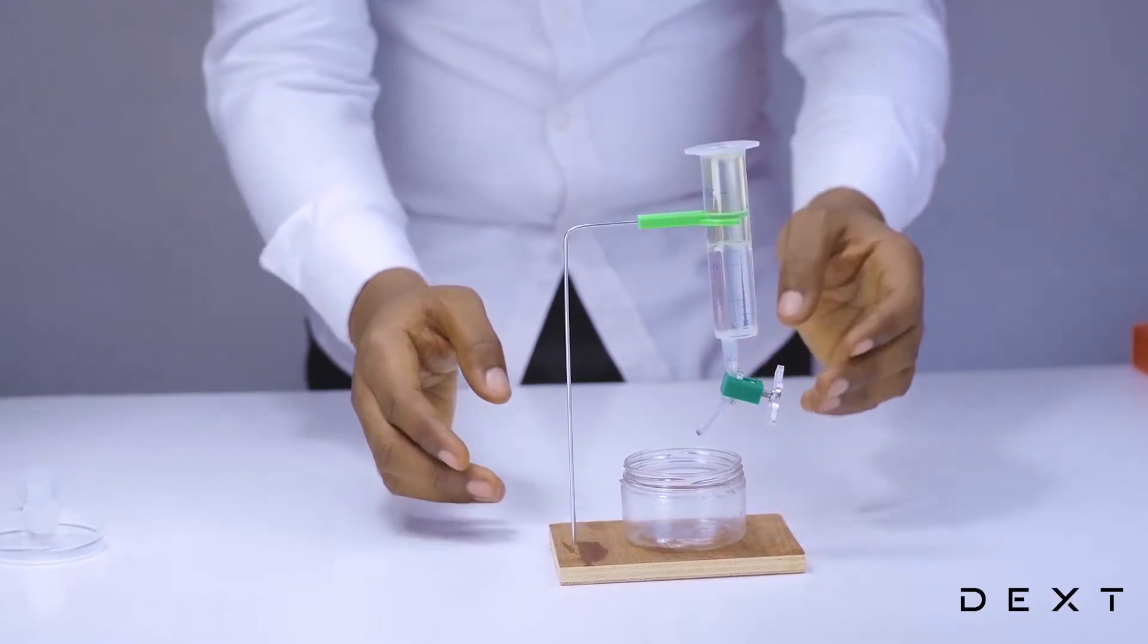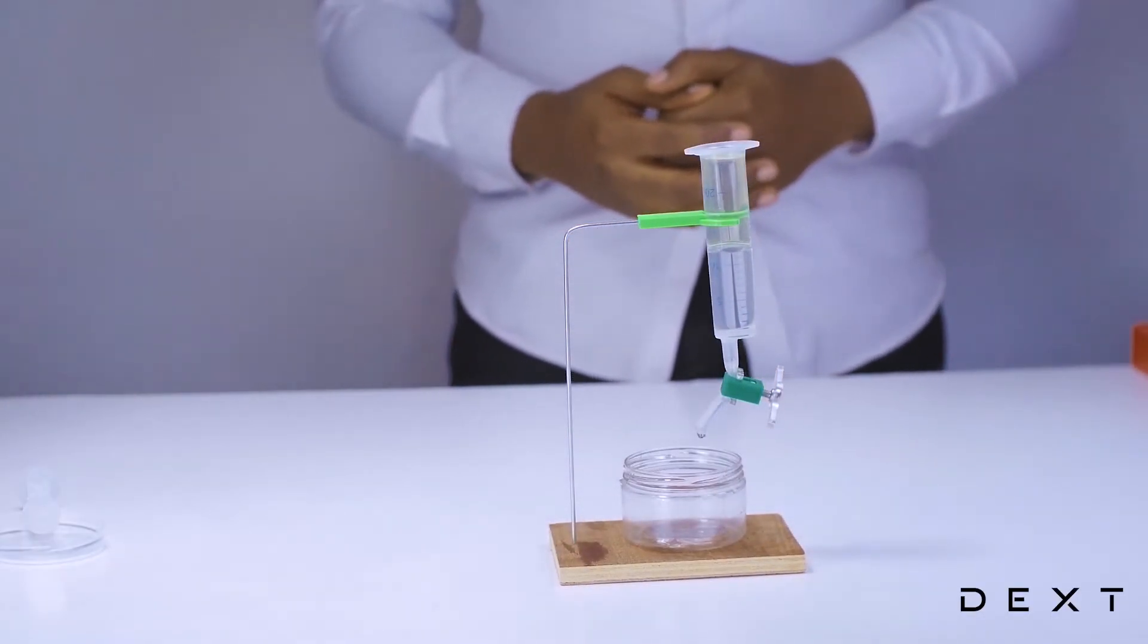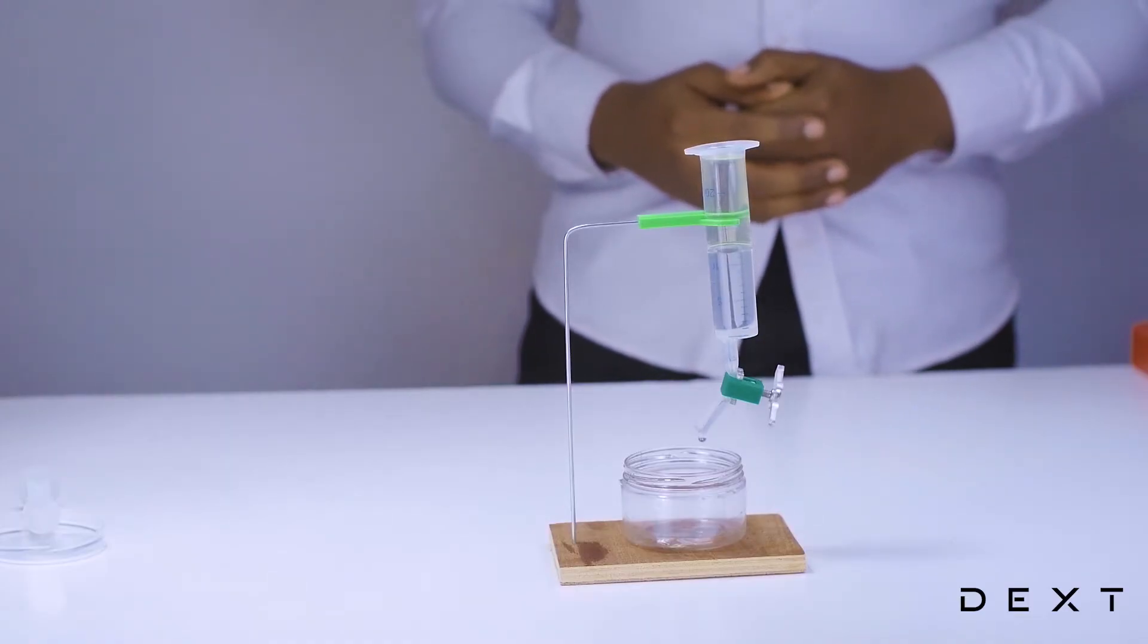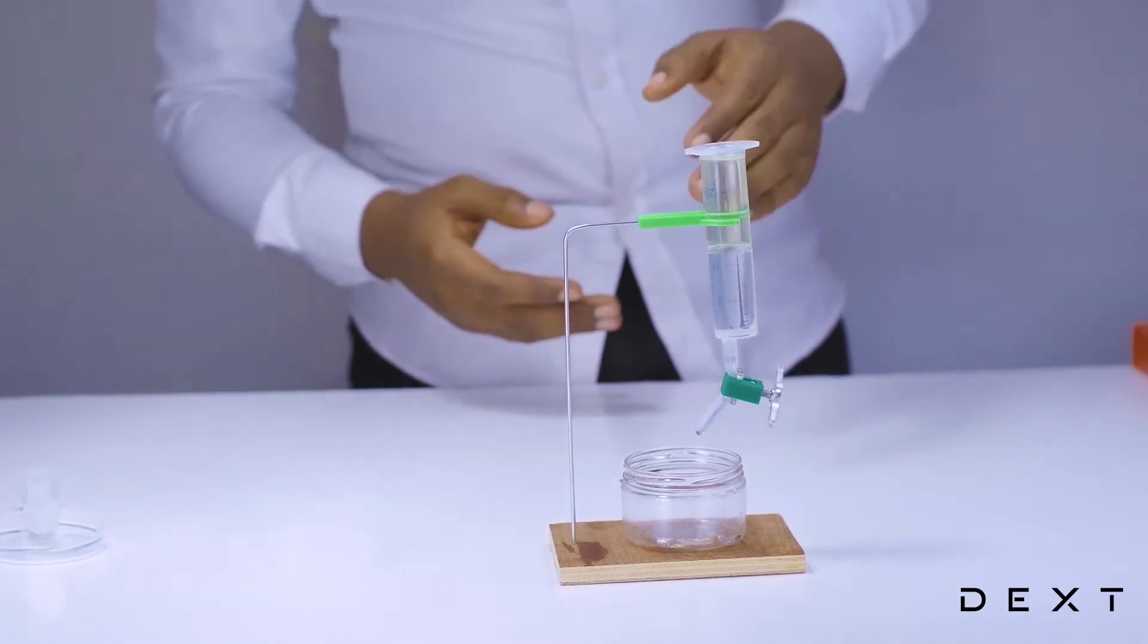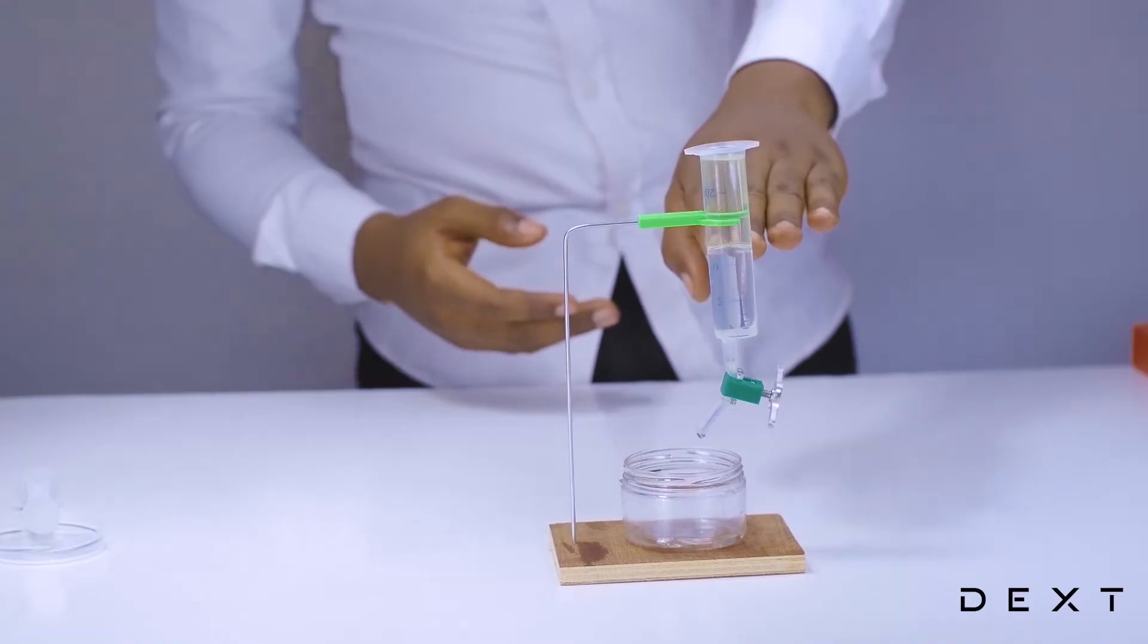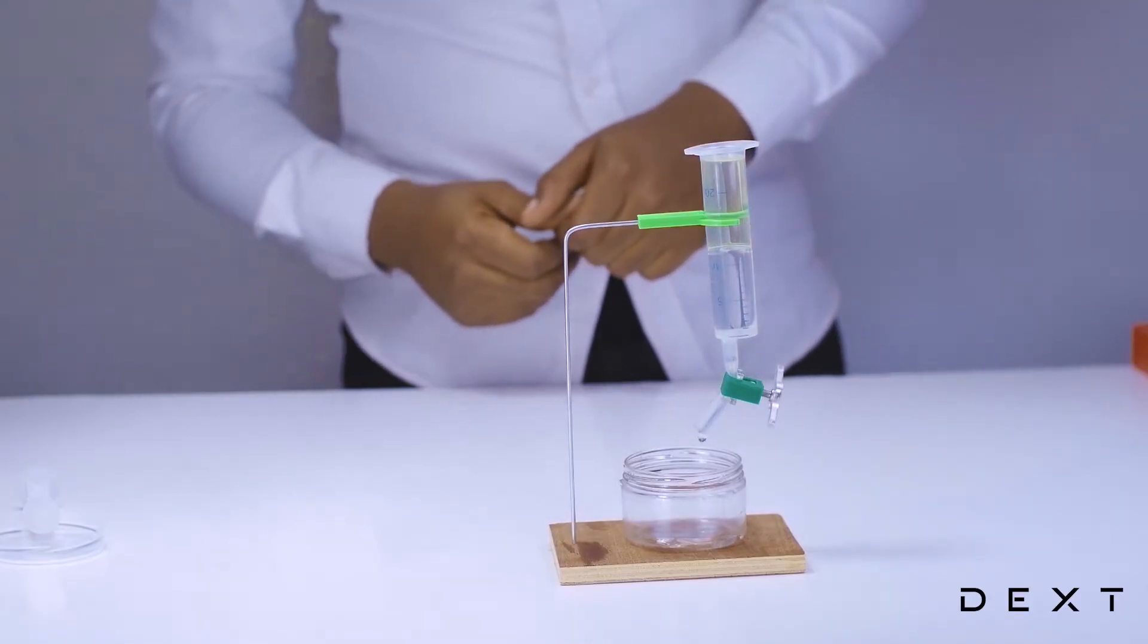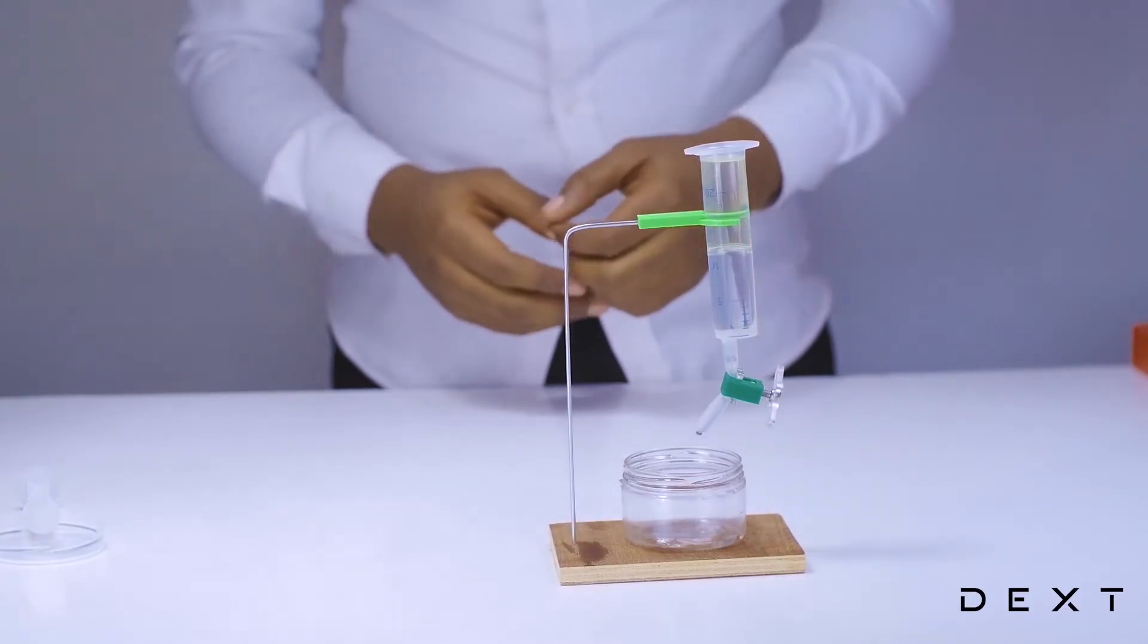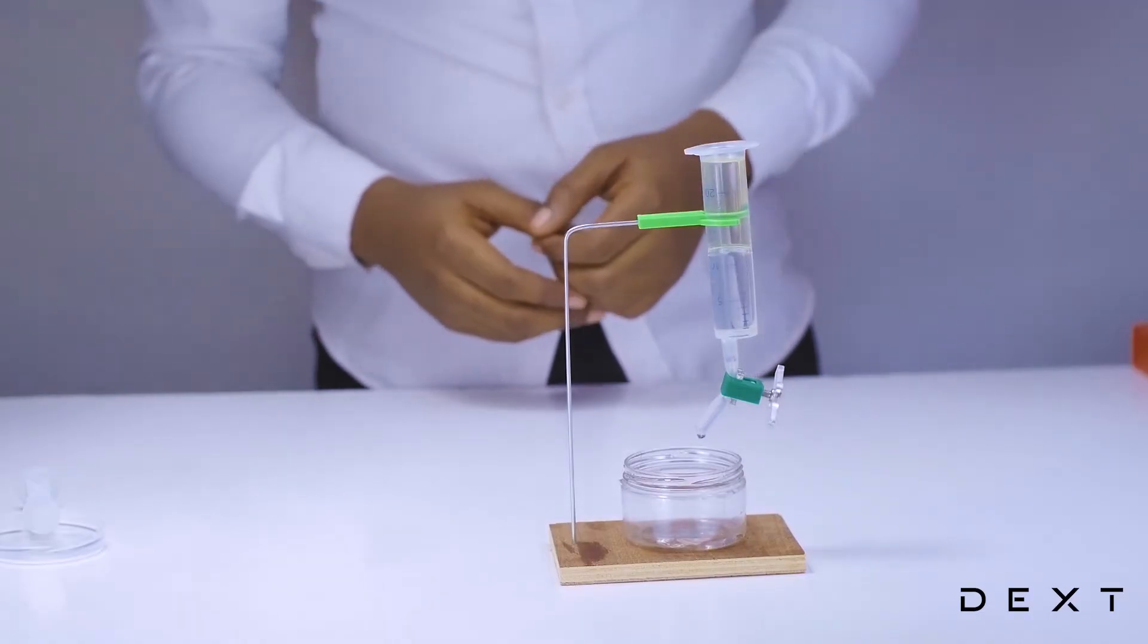You can open the tap to increase the rate at which the liquid is drained. But you can see the liquid on top slowly begins to fall as the liquid below drains.